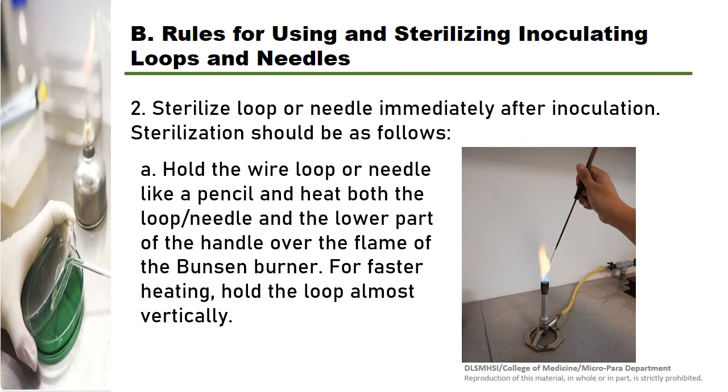For faster heating, hold the loop almost vertically. Holding your loop at an angle almost vertical allows any liquid culture to flow into the flame.